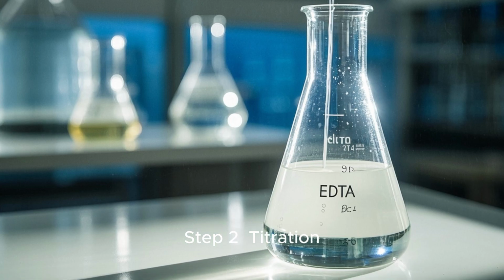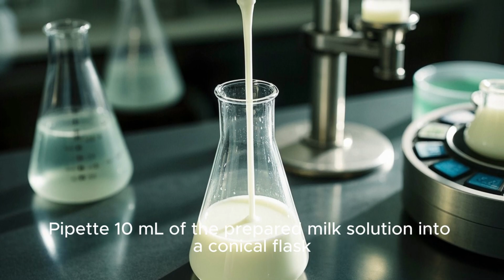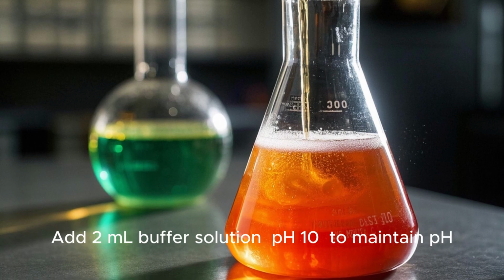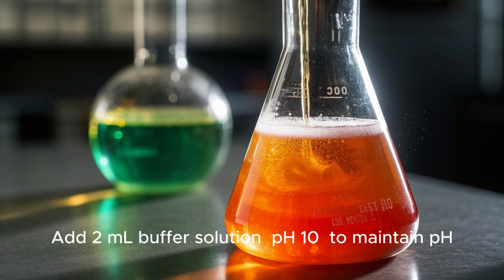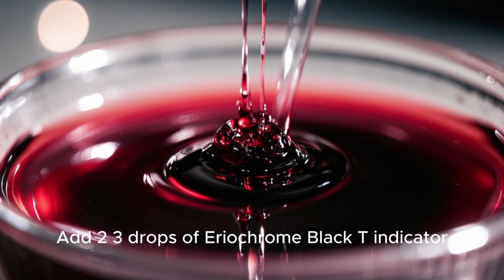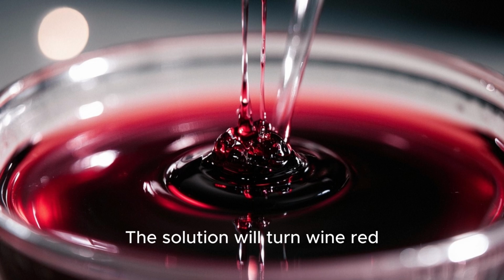Step 2. Titration. Pipette 10 milliliters of the prepared milk solution into a conical flask. Add 2 ml buffer solution to maintain pH. Add 2-3 drops of Eriochrome Black T indicator. The solution will turn wine red.